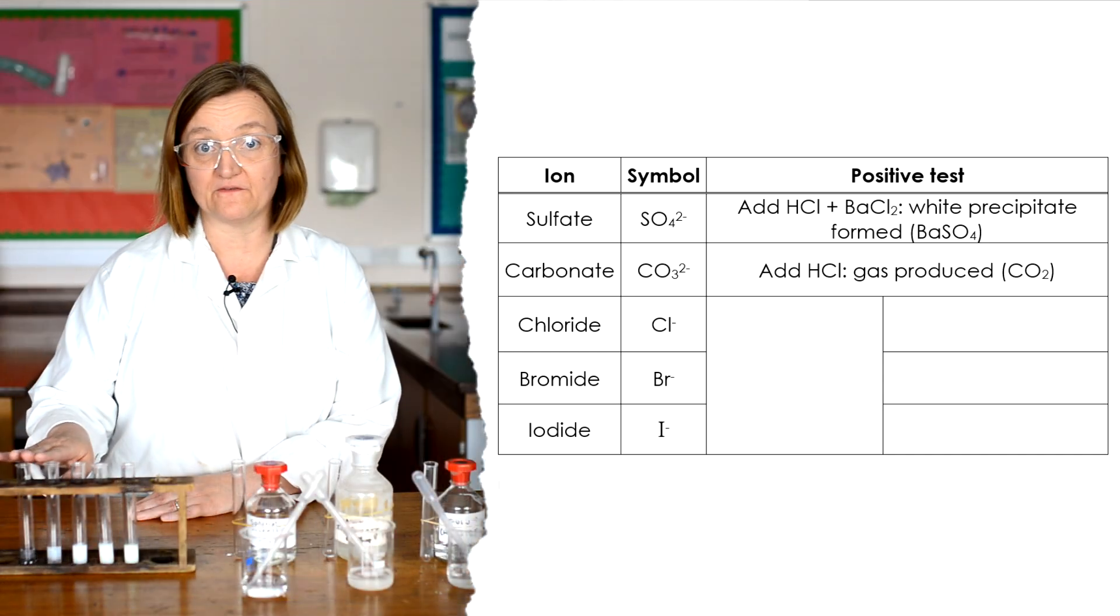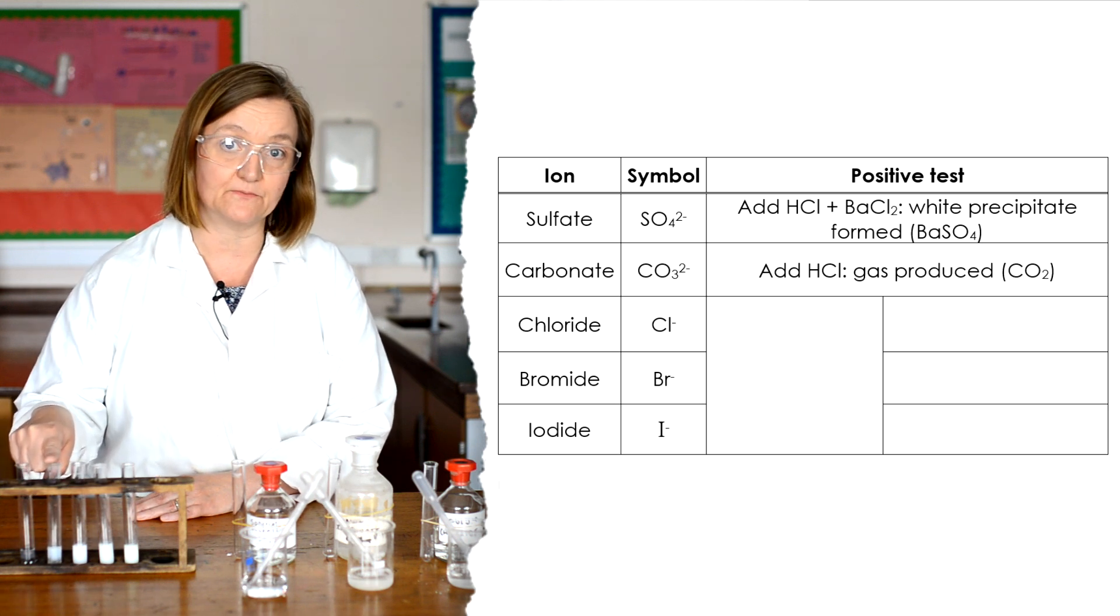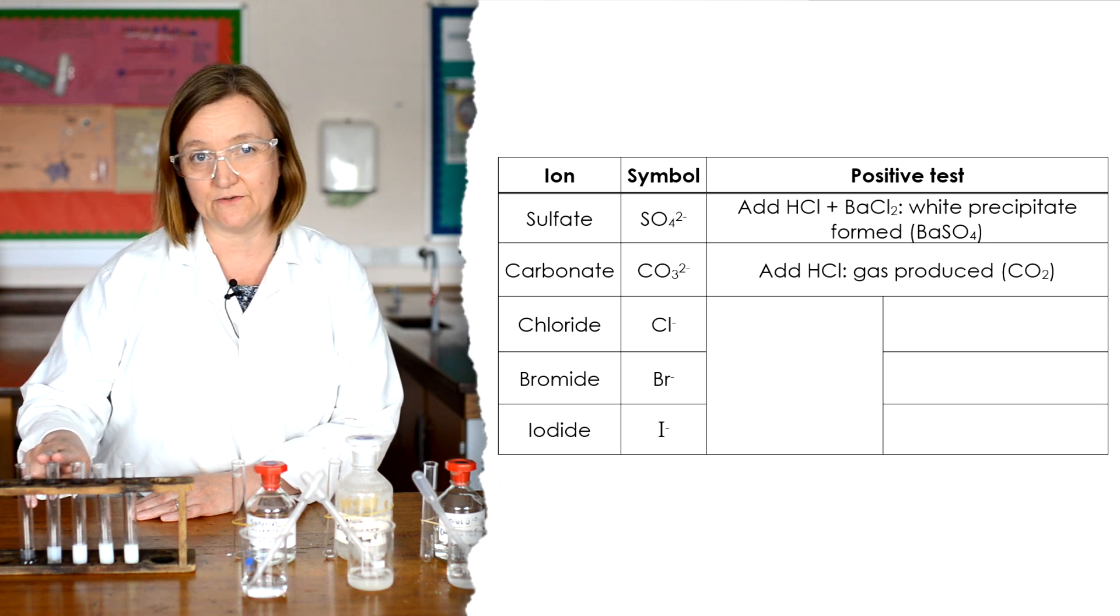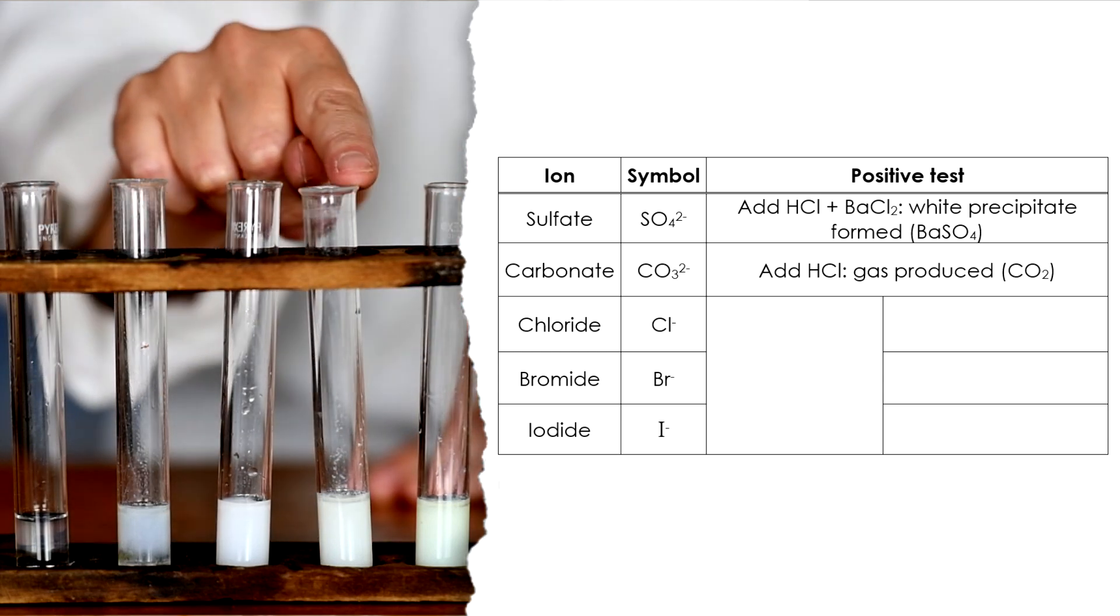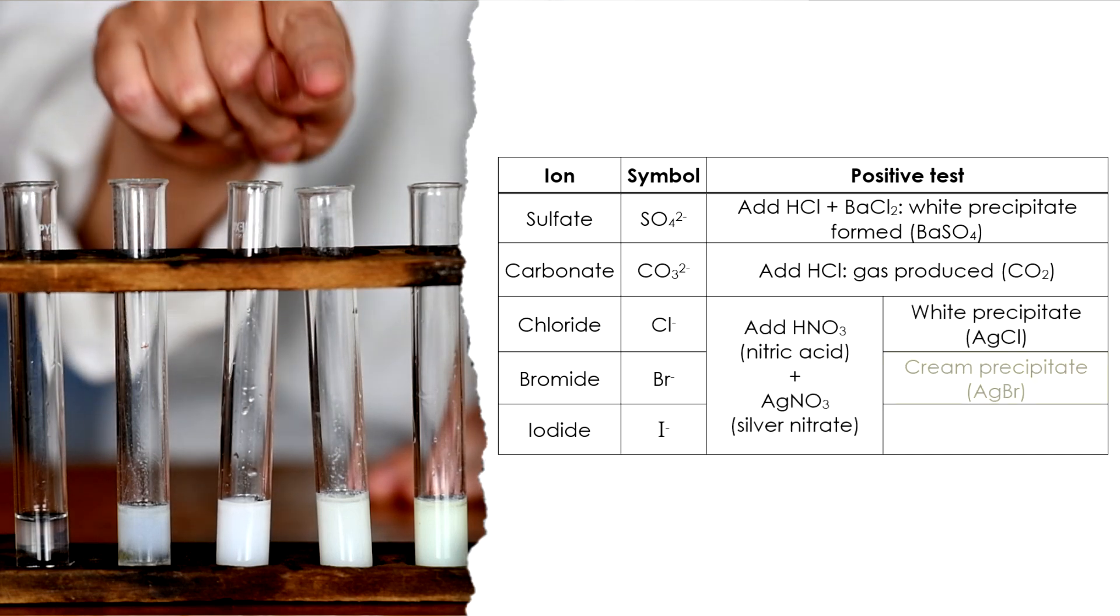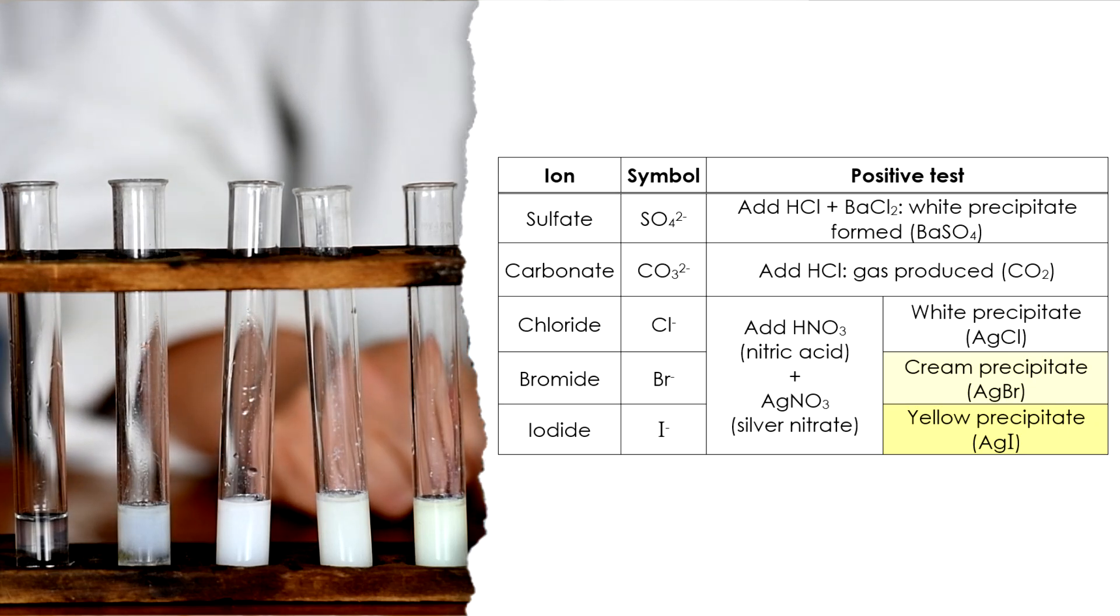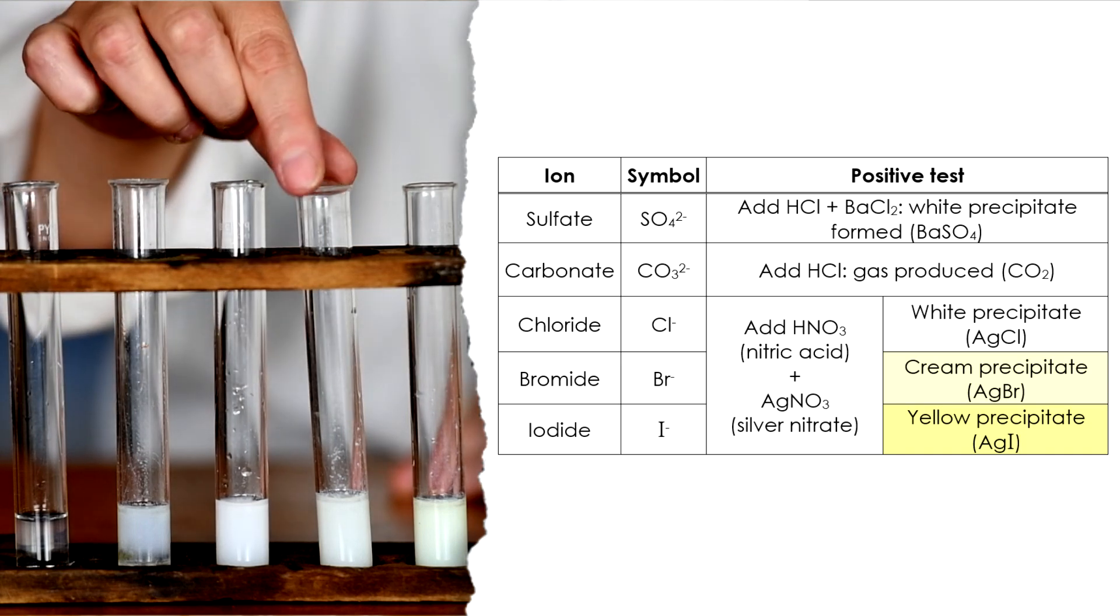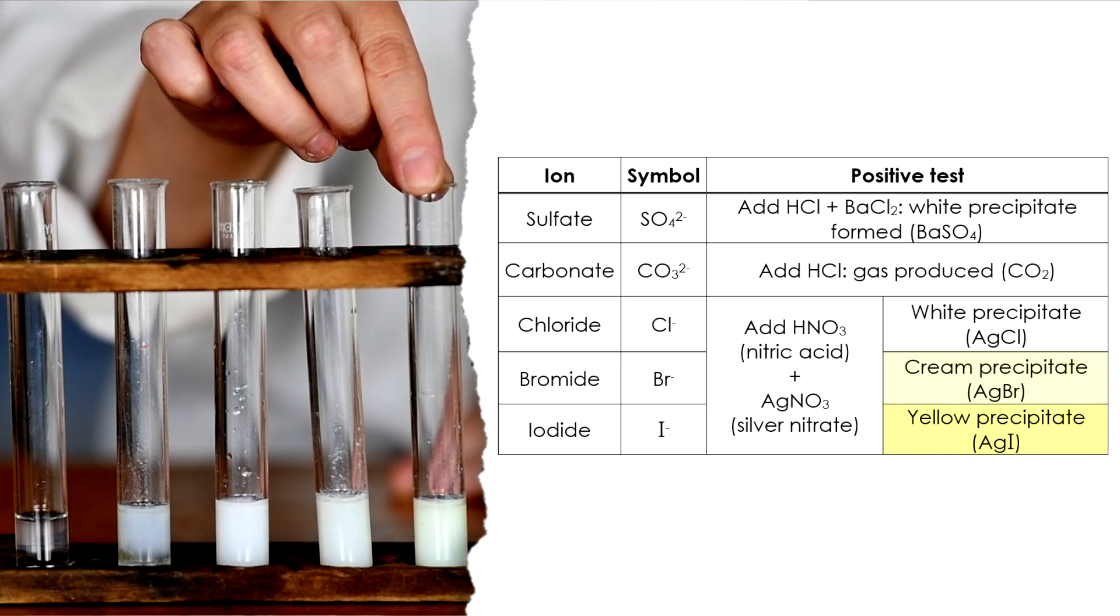So we've got four of our solutions that have produced precipitates. Now the carbonate we know already would fizz with hydrochloric acid. And yes, it gives a precipitate with silver nitrate. But we don't really use that as a test for carbonate. It's these three that we're most interested in. Here we've got an insoluble precipitate of silver chloride, silver bromide, and silver iodide. And what's really important to notice is the difference in the colours. Silver chloride is described as a white precipitate, silver bromide as a cream precipitate, and silver iodide as a yellow precipitate.